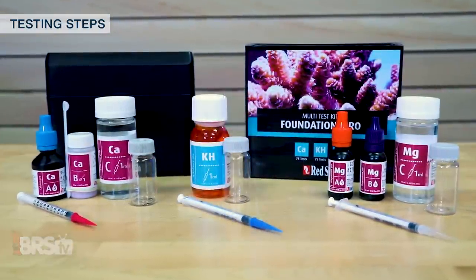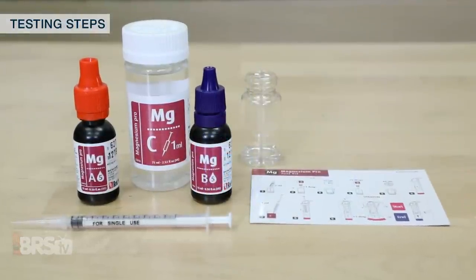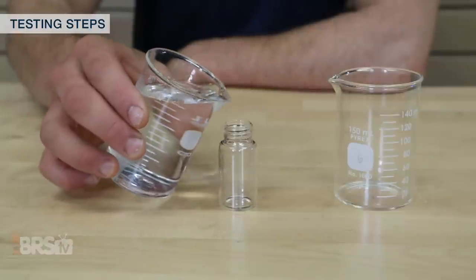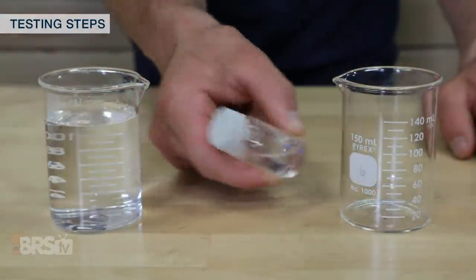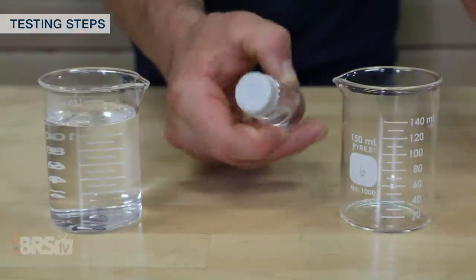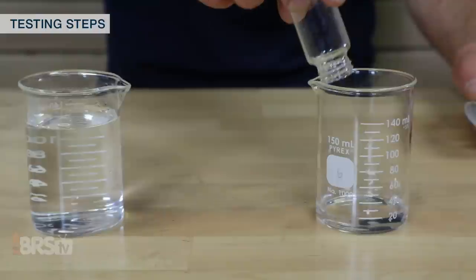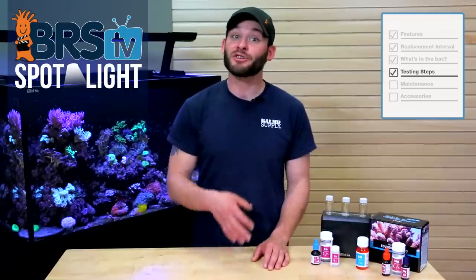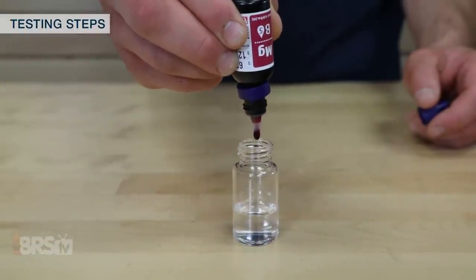Here are a couple of other quick notes before we get started that can be pretty beneficial to getting the most accuracy from your Red Sea test kits. To ensure a clean and uncontaminated testing sample, it's always best practice to give the vial a quick rinse with RODI water to remove any possible contaminants left over from previous tests. Also, when using the dropper bottles, to ensure you get a uniform and consistent drop each time, hold the bottles completely inverted over the vial before giving them a light squeeze.